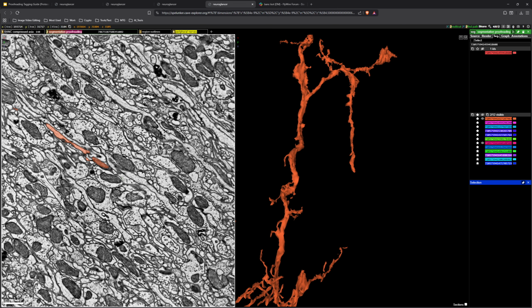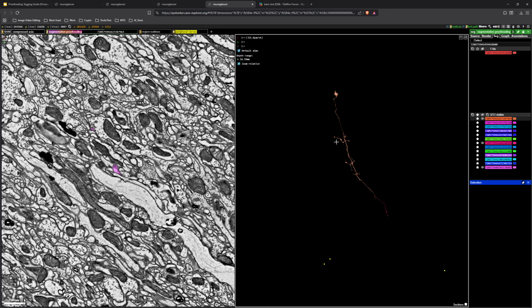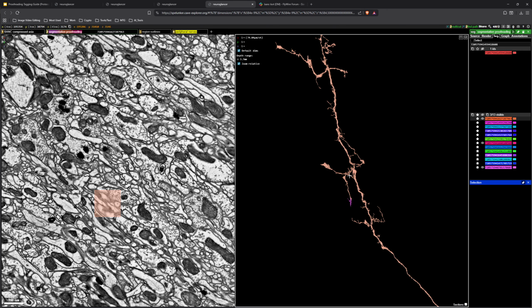Also, this connection could be traced a little bit extra. But as we know, these frills at this layer, this is probably layer 7. And this is probably like, I don't know, some other layers. No, maybe this is layer 4 and this is layer 7 and that's like layer 8 or something.